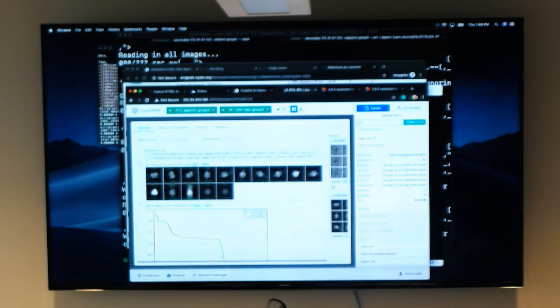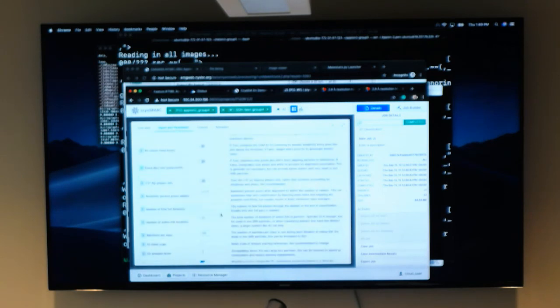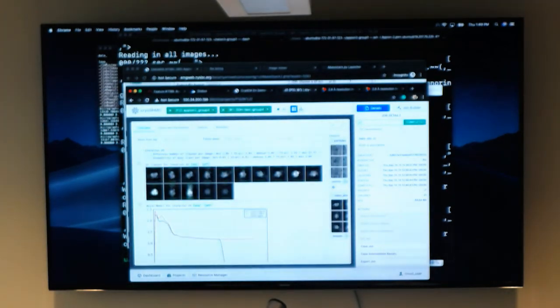By default, you see most of your runs went for 20 iterations. Is that located in here? So the number of iterations by default, typically 20 is enough, but depending on your signal to noise, you may need more iterations. There are certain default parameters that we didn't change, and it's located here, but in case you wanted to, you could always go and have more iterations. The main thing many of you have noticed when doing classification is that K is variable. So do you need 1 class, 2 classes, 10 classes, whatever? That's really up to you.